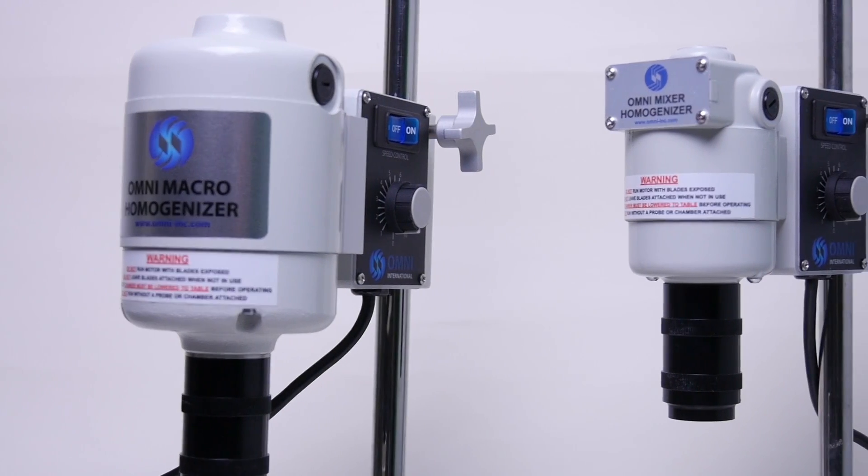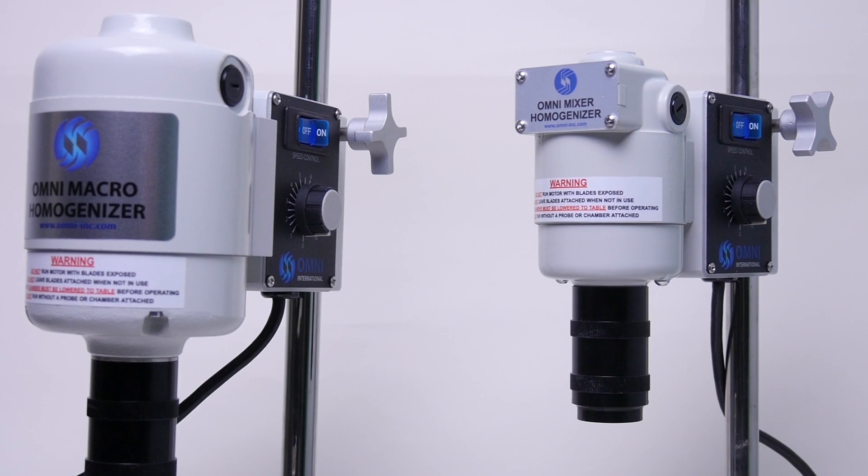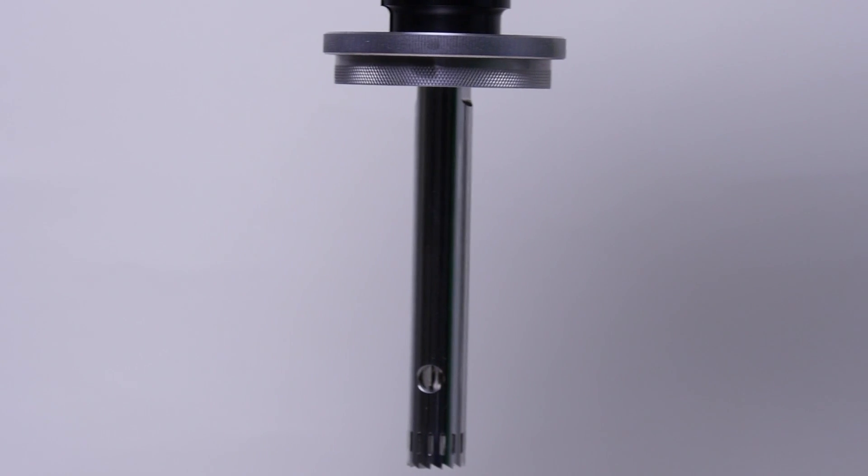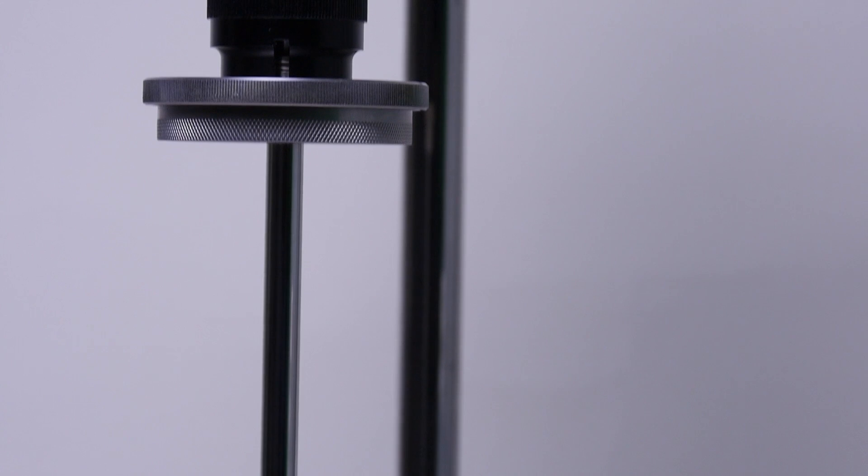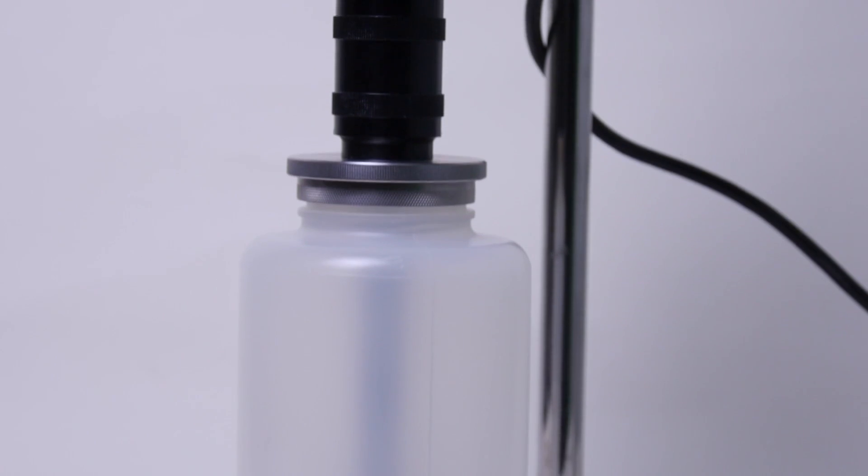Omni Mixer and Macro homogenizers can be used with a large assortment of generator probes and cutting blade accessories, both of which were designed to be interchangeable inside specially designed sealed containers.